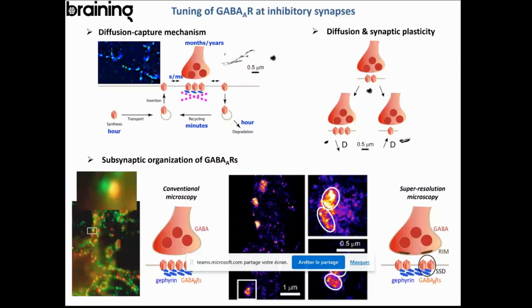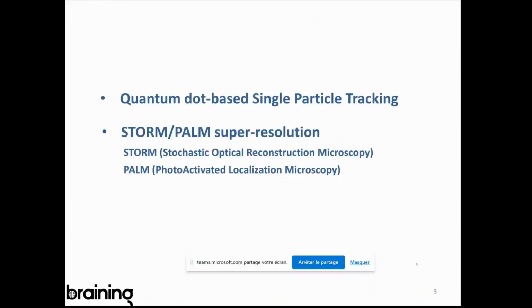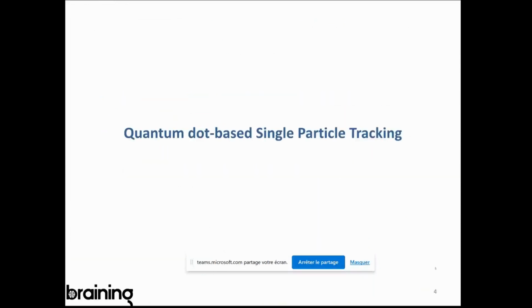All right, so concerning the 2 techniques I'm going to talk about today, I'm going to start by talking about the quantum dot-based single particle tracking approach. So here is an example.